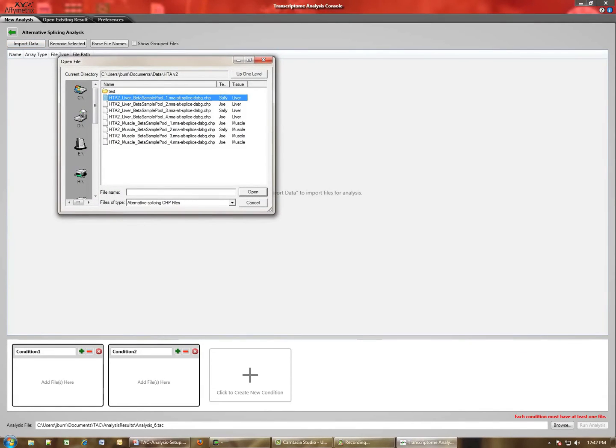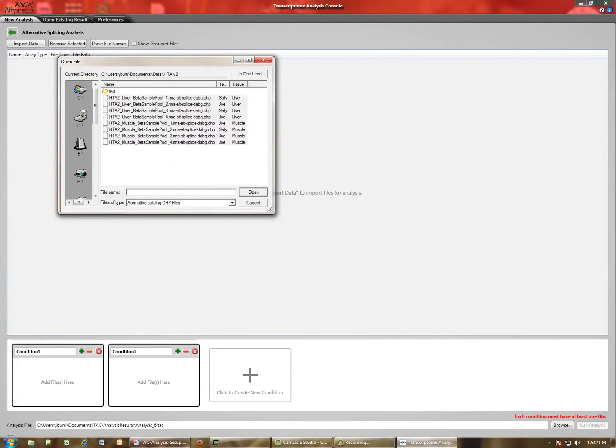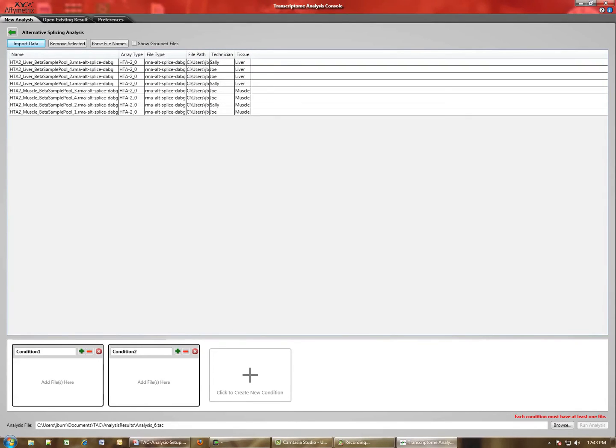Navigate to the folder that contains your files. In this case, I've selected the HTA array sample data available from Affymetrix.com.